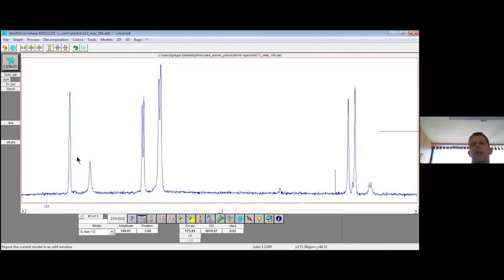We decided these molecules have carbon, proton, and fluorine atoms, which are sensitive to NMR, so it might be useful to record these spectra. And for the zeolite, which is in principle an aluminosilicate, but in our case was almost pure silicate material, we had silicon as a possible NMR active nucleus. And then we recorded spectra of all these nuclei.